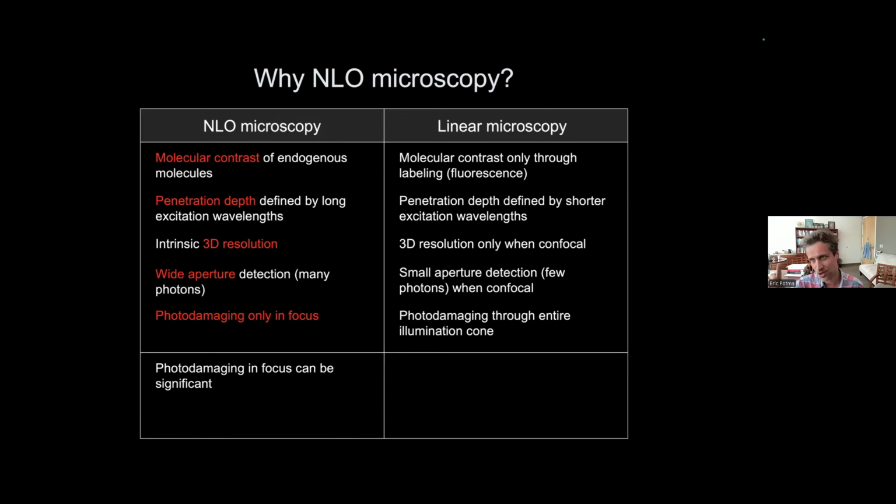But, and of course there's a big but, the photodamage in the focus can be quite significant, okay? Because there, optical nonlinearities are amplified, not just your favorite optical nonlinearity, the one that you're interested in for your experiment, but also other nonlinearities, ones that lead to photodamage, okay? So you have to be very careful about how much light you send in.